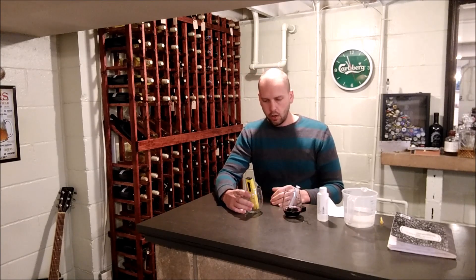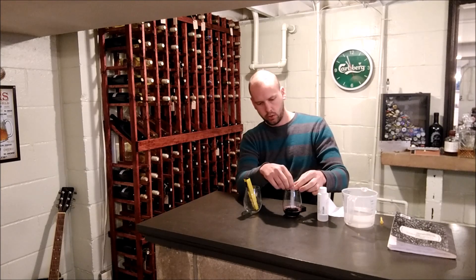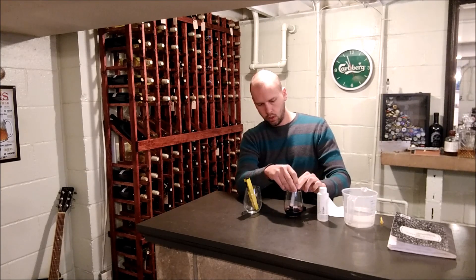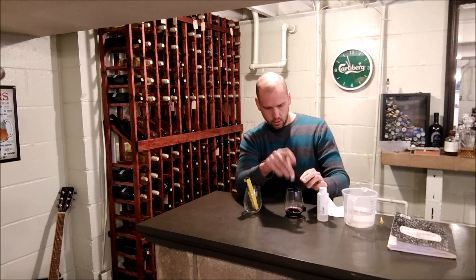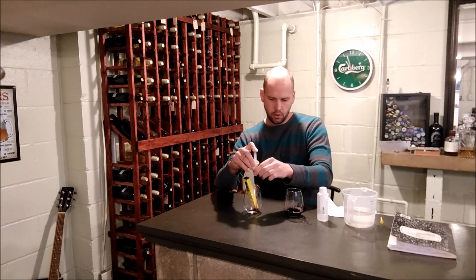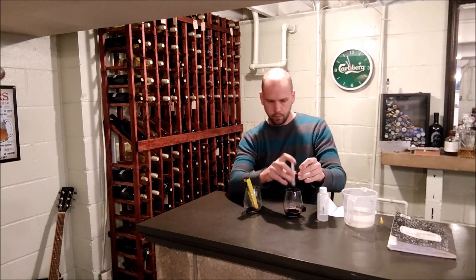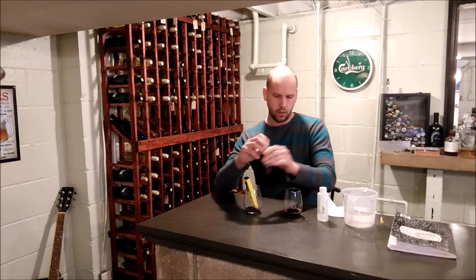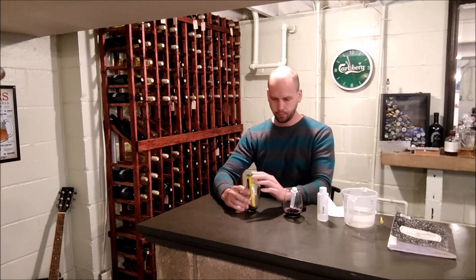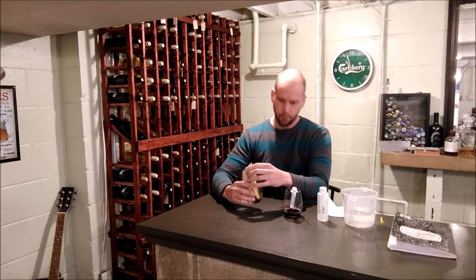I'm going to add a known amount of wine — 15 milliliters — to my glass, leaving my pH meter dipped in. So there's 10 milliliters, and there's 15 milliliters. This is a merlot we're using. Looking at the pH meter, we're at 3.4 right now.